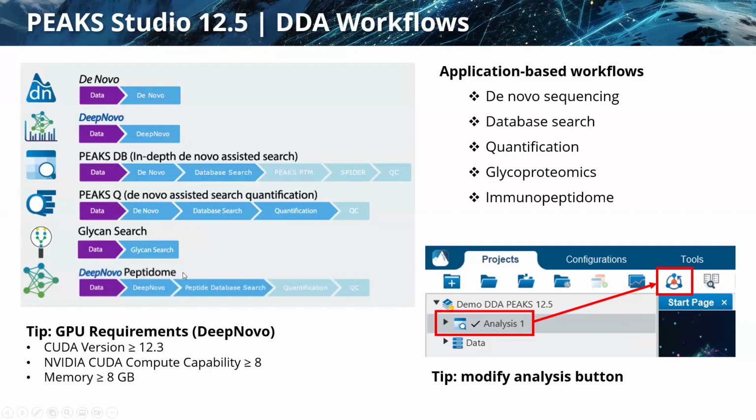Another tip I want to give at this point is the GPU requirements. So in our newer versions of Peaks, certain workflows can take advantage of a GPU resource. And so I'm going to explain that in a little bit more detail here.